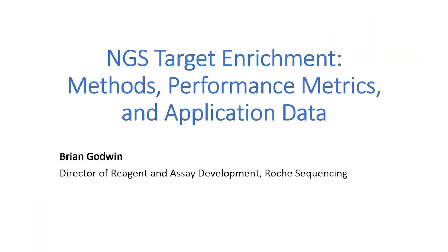All right, thank you for the introduction and for giving me the opportunity to talk about target enrichment for next-generation sequencing. I'm going to be talking about some methods, performance metrics, and application data, but I'm going to start with why do target enrichment for next-generation sequencing?